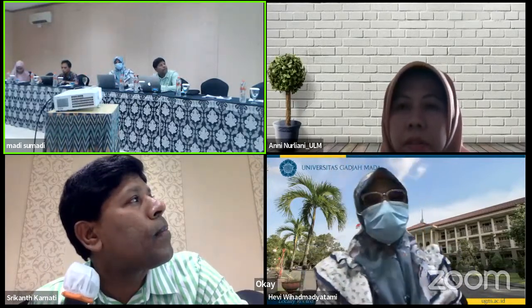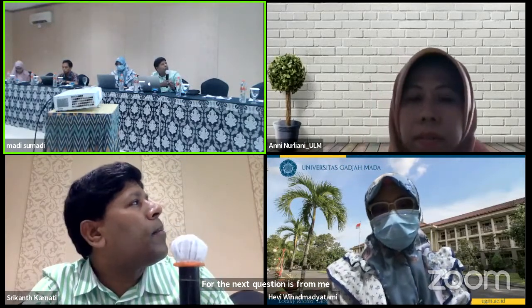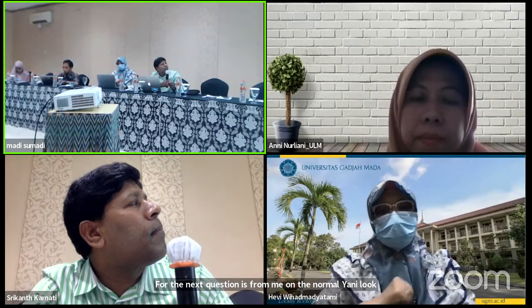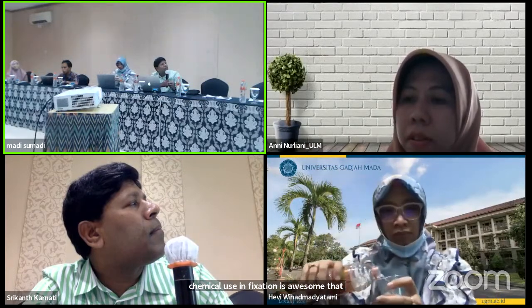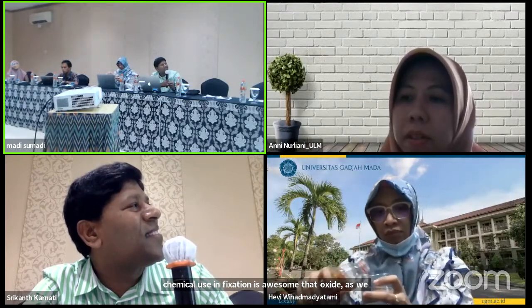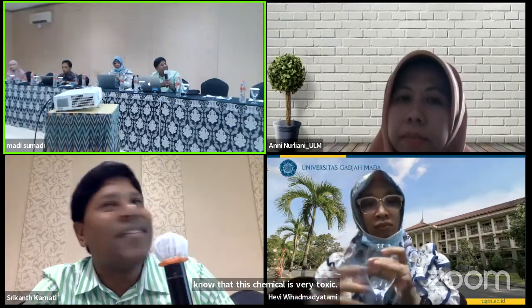The next question is from Ms. Ani Nurliani. The question is, like you mentioned before, one of the chemicals used in fixation is osmium tetroxide. As we know that this chemical is very toxic, what is the safety procedure when we use it for sample preparation in SEM or TEM?